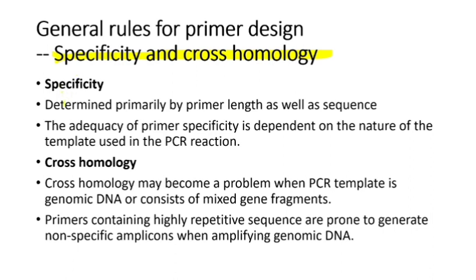Specificity is determined primarily by the primer length as well as the sequence. The adequacy of a primer's specificity depends on the nature of the template used in the PCR reaction. So the specificity of the primer depends on the template used in the PCR reaction.